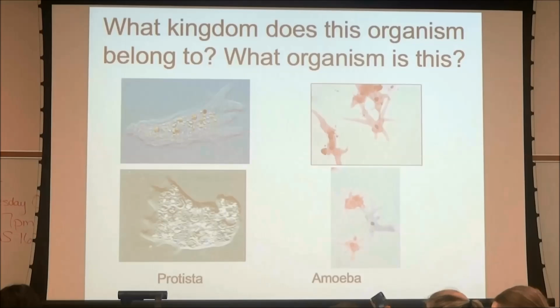Pseudopods. Good. You can see the little pseudopods here, and you can see the nucleus. Now, you guys will never have a living amoeba because not everyone got to see one. But you can definitely have the preserved amoebas on your exam. Okay?